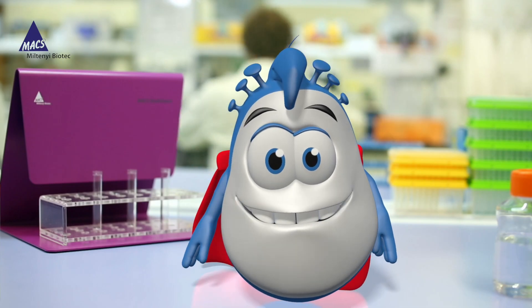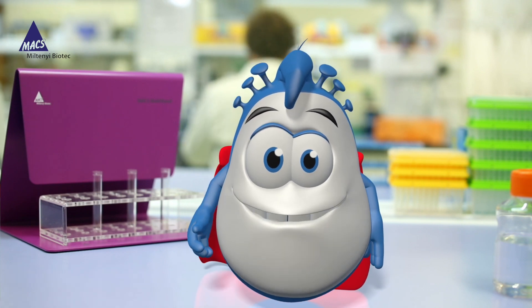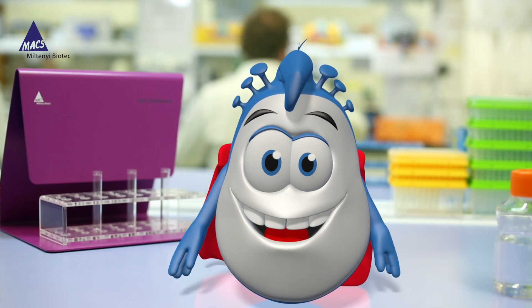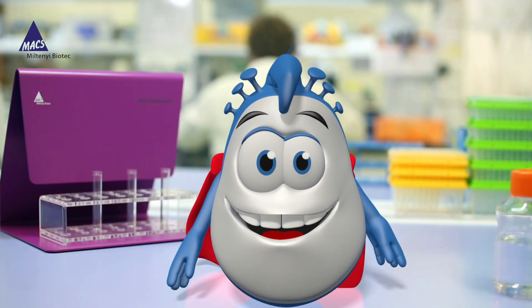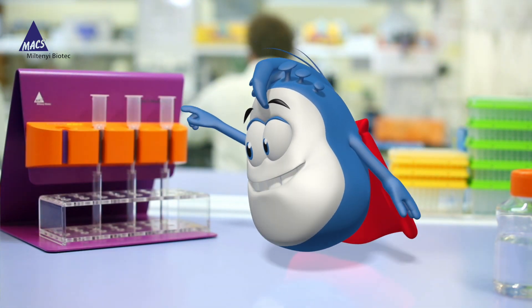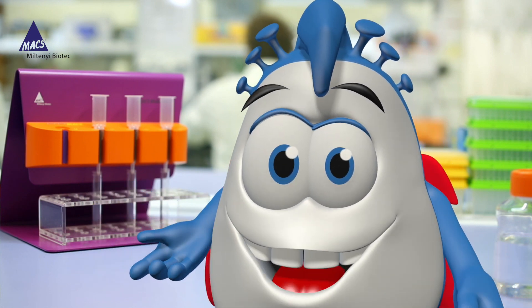Hello there! I'm Captain T-Cell and today I will tell you why MACS Technology is the best choice for isolating your cells. With MACS Technology you simply need three things: a magnet, a MACS column, and MACS MicroBeads. Let me show you how it works.